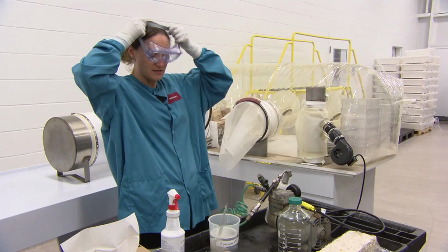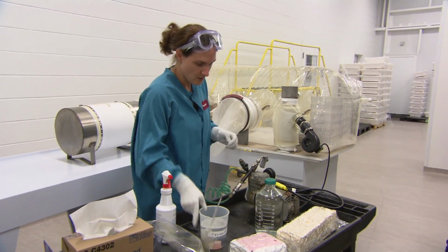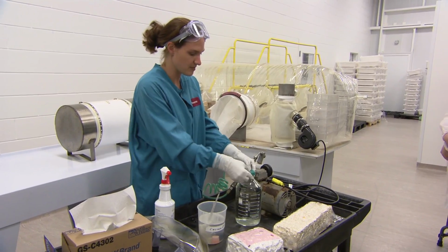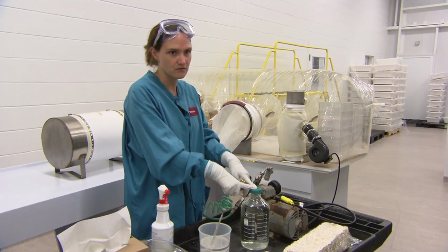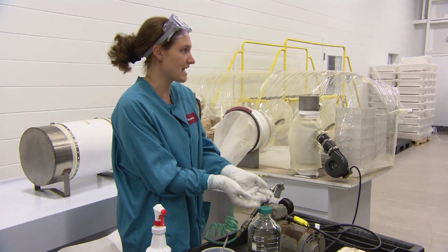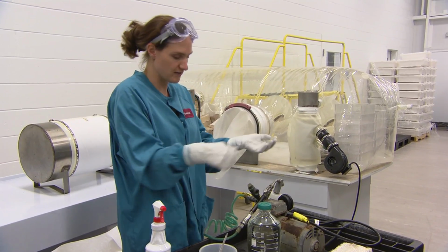So next, we're going to add our water. And now our water we know has been autoclaved because this top here is sunken in. So we use these special tops that prior to autoclaving, they're popped out. So once they have been autoclaved, the top sinks in, and that way we know it's been autoclaved properly.